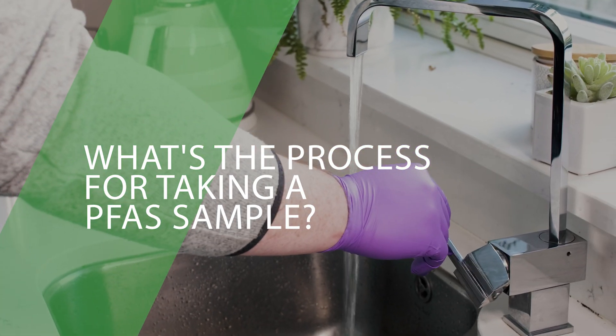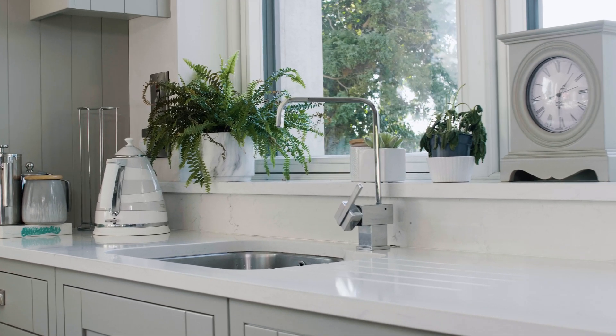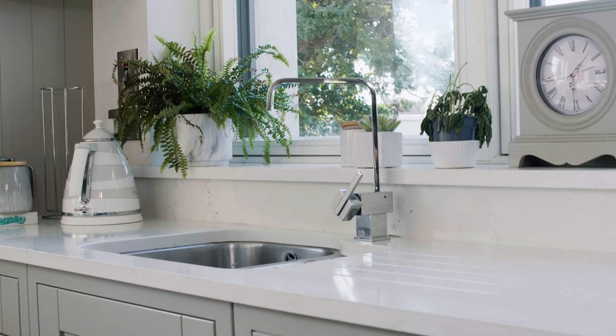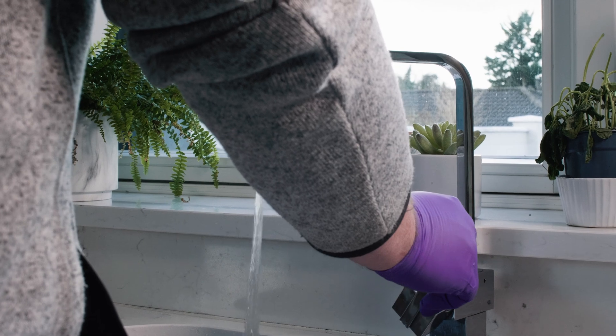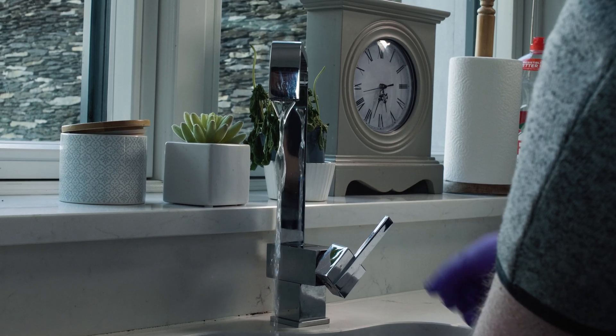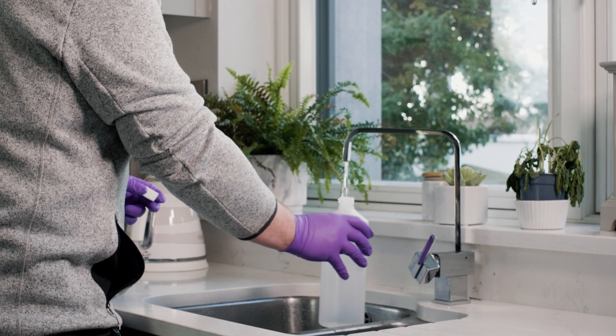What's the process for taking PFAS samples? 1. Ensure the area around the sink is clean and free from typical PFAS items as mentioned before. 2. Let the tap run for at least 5 minutes at a high flow rate. 3. Before sampling, reduce the flow rate. 4. Using new nitrile gloves, collect the samples for PFAS first, prior to gathering samples for any other parameters using other containers. This avoids contact with any other type of sample container, bottles or package materials.